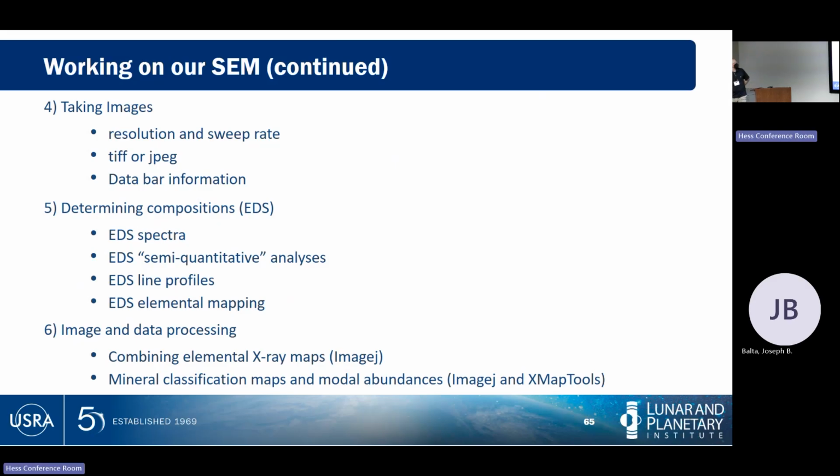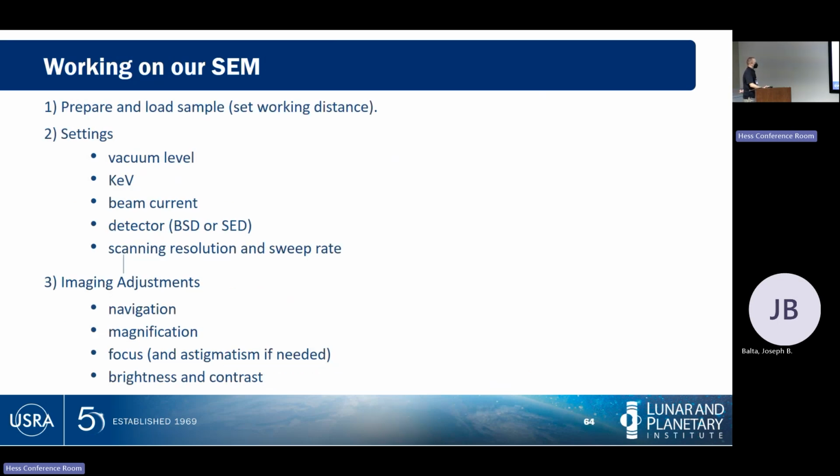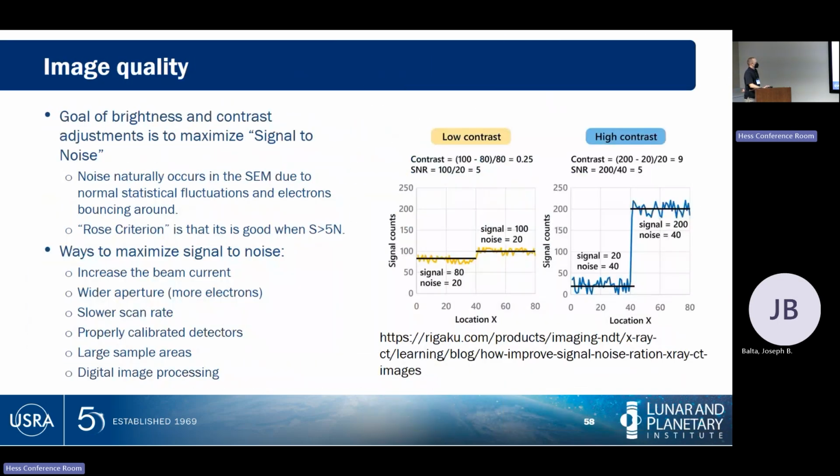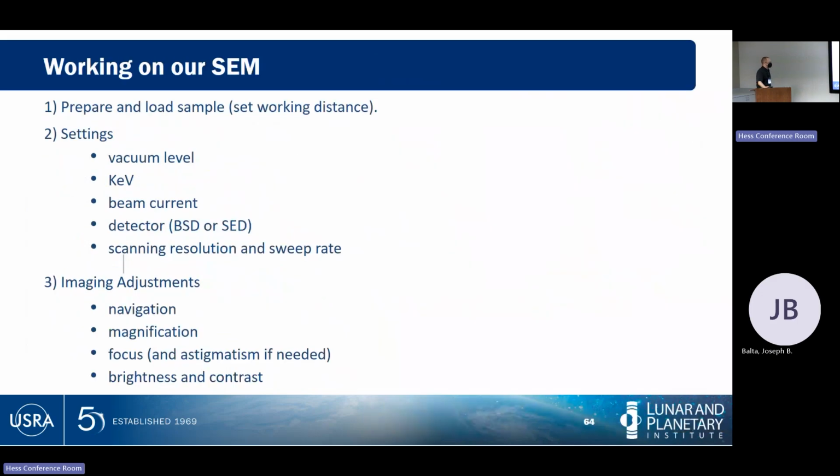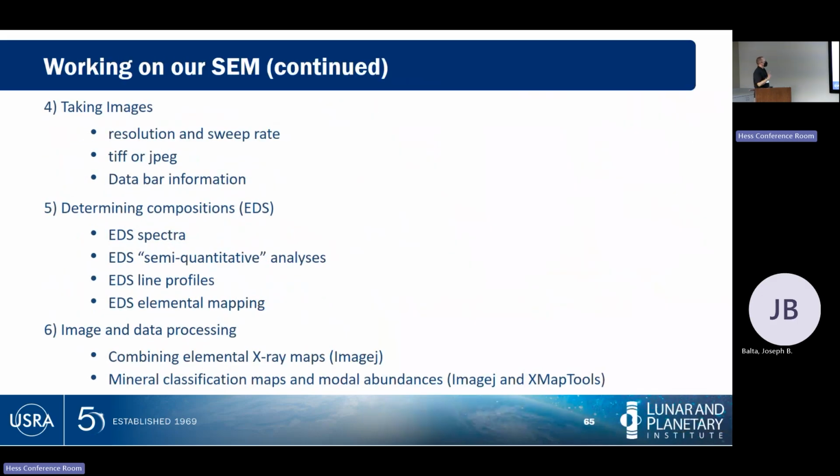When you actually take an image, you're going to want to determine the image resolution. File size is a good one to save in here also. And also, on these types of images, do you want a data bar? Do you want a scale bar? Do you need something at the bottom saying what your file name is? Those are very common on there as well.